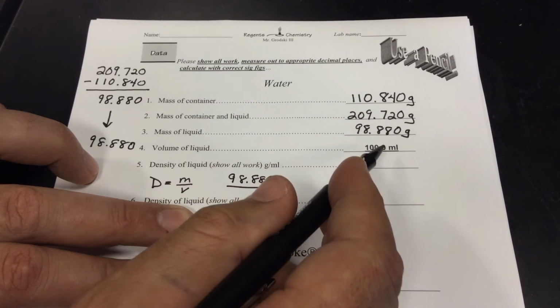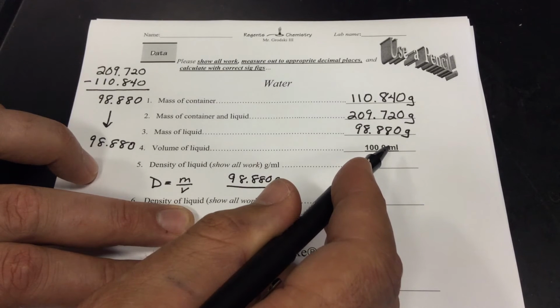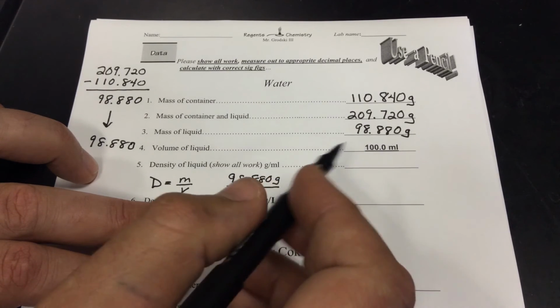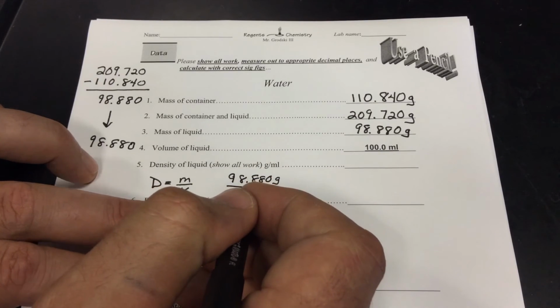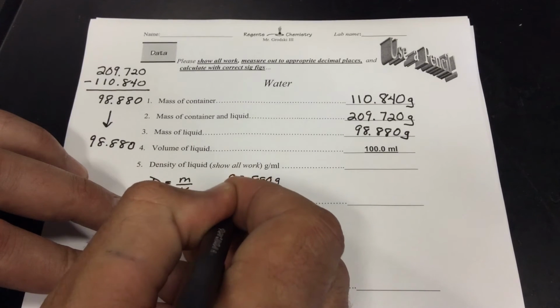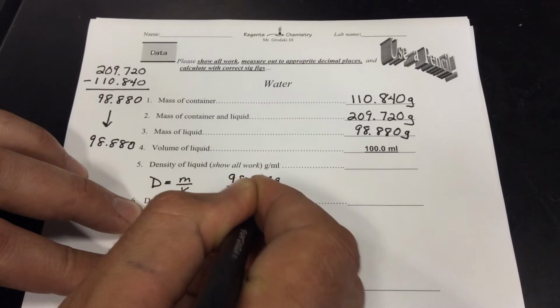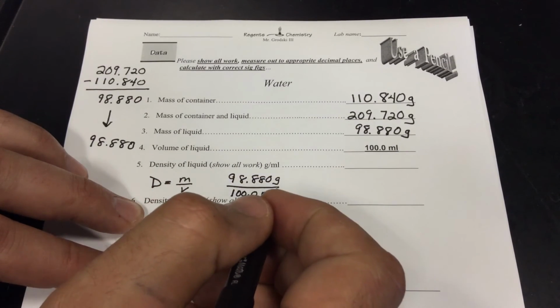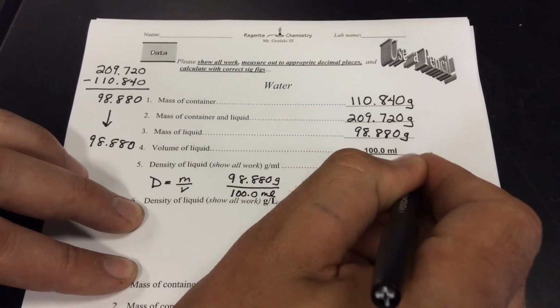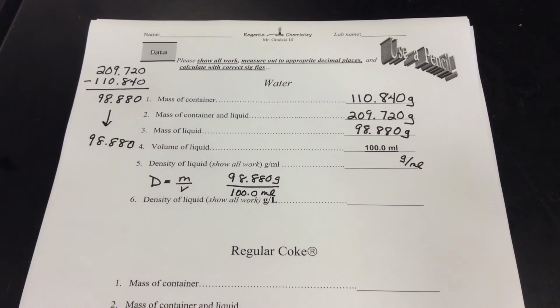over the milliliters. Now notice in this lab we're using milliliters, but you should also know that a cubic centimeter is the same volume relative. It's the same amount of fluid that takes up that space. So 98.880 divided by, guess what, the volume, which is 100.0 milliliters. Okay, you notice we're going to get grams divided by milliliters here. And so you're going to put that into your calculator.